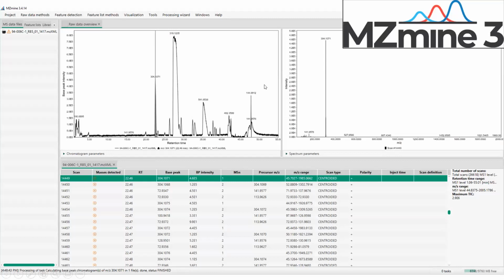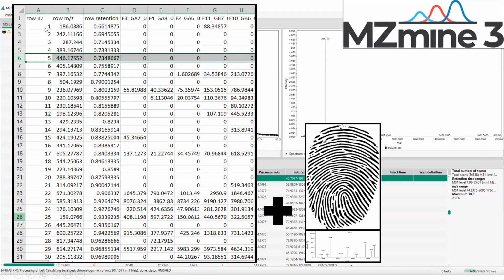The feature quantification table. So this is essentially just like an Excel sheet, a spreadsheet or data frame, just shown on the left here. And each feature that we detect has a number. It has a mass, obviously, or mass-to-charge ratio, the retention time, and then the abundance of that feature in each sample that we're looking at. And then at the same time, through processing data in MZmine 3, what we get is a second file, which is the MS2 spectra for each feature, basically. And these are the fingerprints that we can then use for database search.